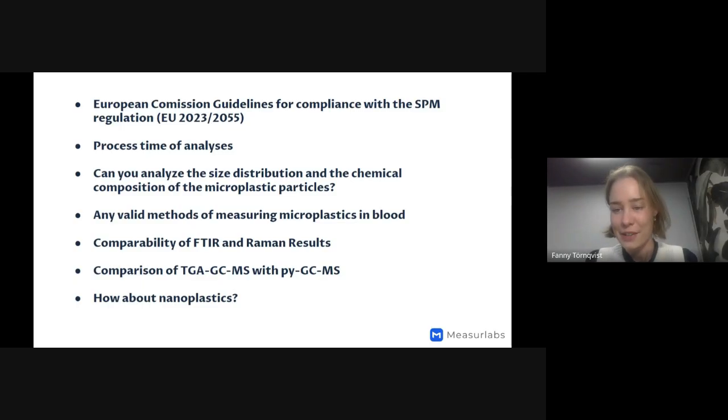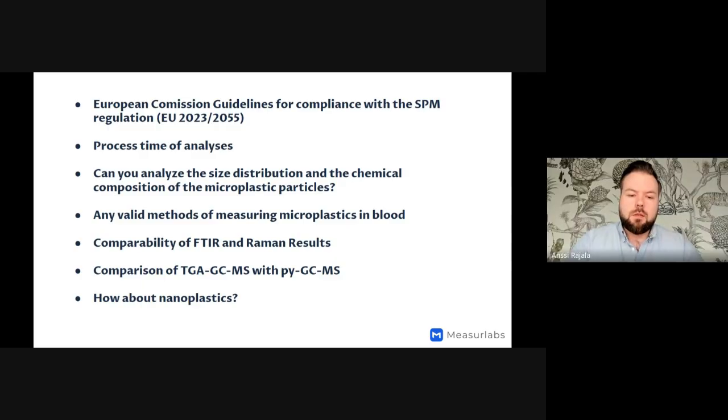Well, actually, this second question is very much related, continuing on the same topic. Marta is asking about the minimum volume of biosamples, so blood and other human or animal samples. Usually in case of fluid samples, at least 2 milliliters should be provided. The absolute minimum that we would need is 1 milliliter, so it would be best to have twice that.